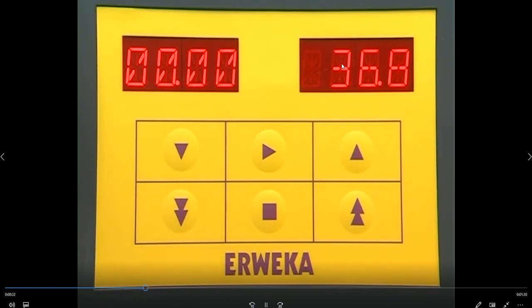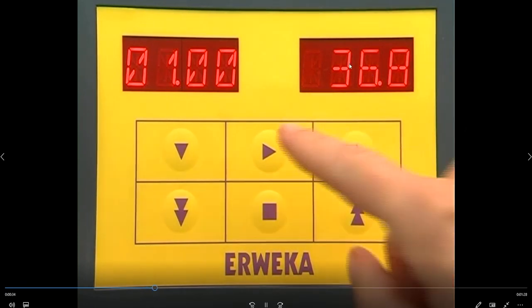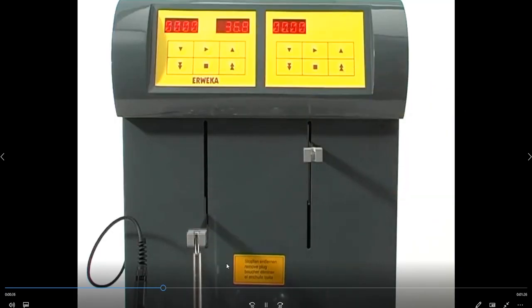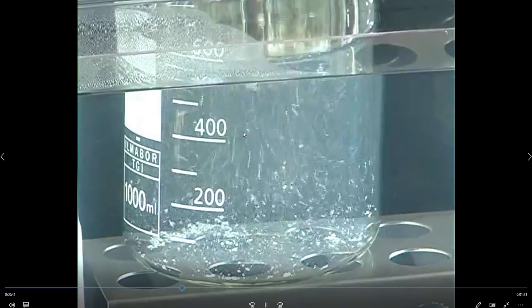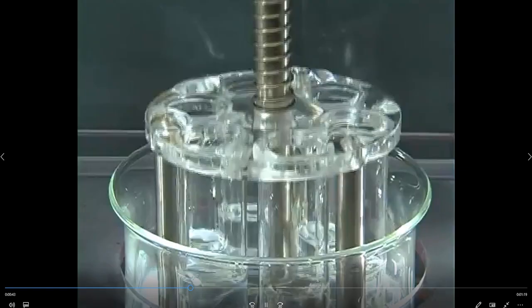Of course, you see here the temperature. It has to be 37 plus minus 2. Now it's working as you see it. It has to be always under the medium.